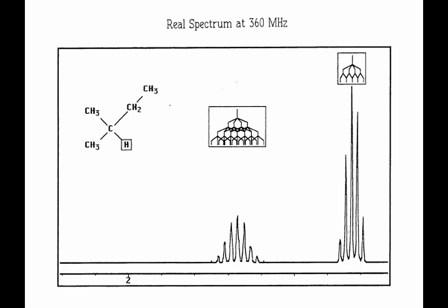But I don't have 32K, and I don't have a room to put it in. And you can't have two big magnets in the same room. That doesn't end well. So that's okay. Case has big magnets. We can make friends, and we can go down there and we can run samples. Or we've got Akron, or we have Kent, or we might have friends at the Ohio State University. You never know. So we can go out and use these bigger magnets.